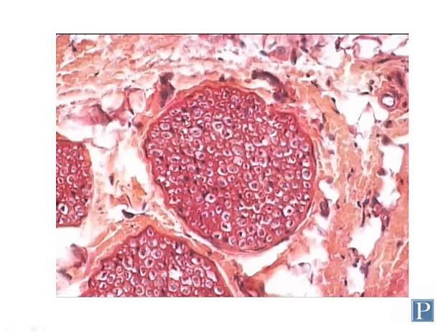So in this slide, this is a higher magnification view. Here's one fascicle. Here's part of another fascicle that's cut off. Here's part of another one. You can see the perineurium on the outside of this fascicle right here. And inside the fascicle, you can see axons, both myelinated and non-myelinated.